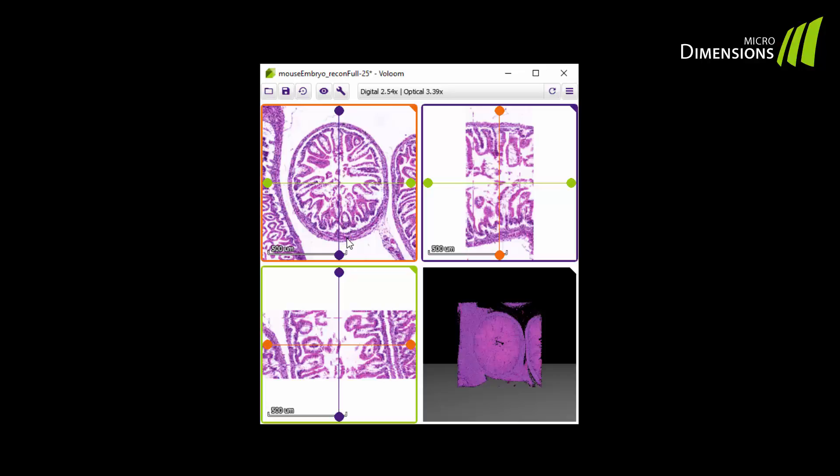In the lower left corner, you can see the stack of sections as if they had been cut along the green axis you see here.